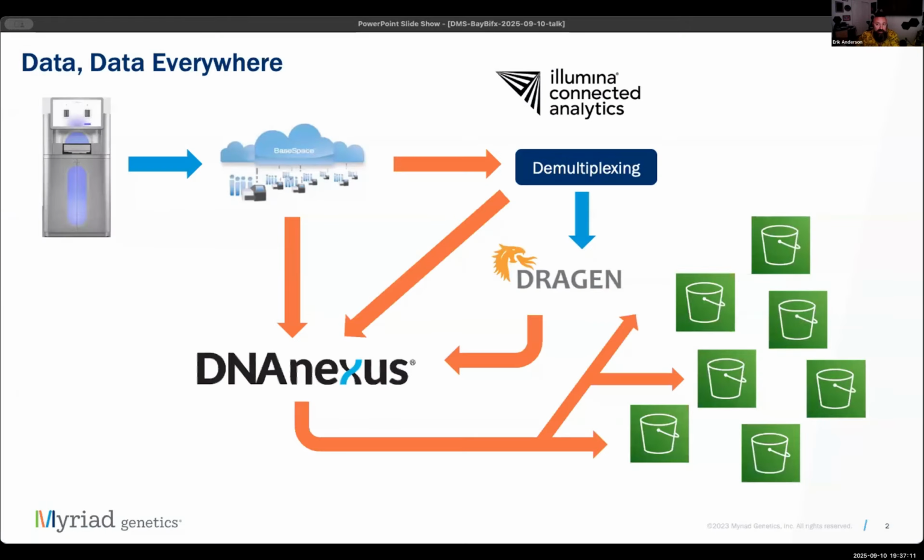We've learned about the complex orchestration involved in productionizing MRD. This complexity creates three data-related problems: validation overhead, compliance risk, and redundant data. Files flow from platform to platform, are used to create new files that in turn also flow from platform to platform, and ultimately arrive at their final destinations at many places throughout the system.